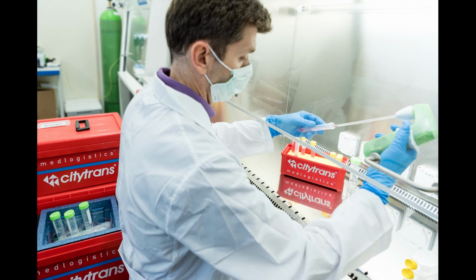Going up a level, you get to Biosecurity Level 2. This is also known as your Physical Containment or PC2 laboratory. This is the next level up and is used for microbes that may pose some hazard, particularly to people who, say, might be slightly weaker, older, or otherwise sensitive to infection, that there is some modest risk of danger to the environment should it escape.